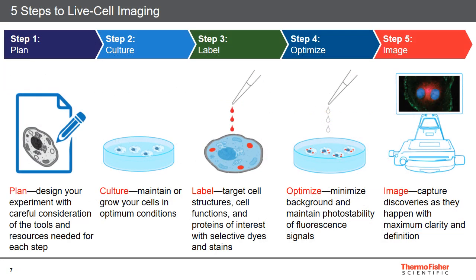Going back to our outline of steps, we will now move into the meat of the rest of this talk, which, as I mentioned in the introduction, will be focused on steps 3, 4, and 5, which are the labeling, optimizing, and imaging in live cell cultures.